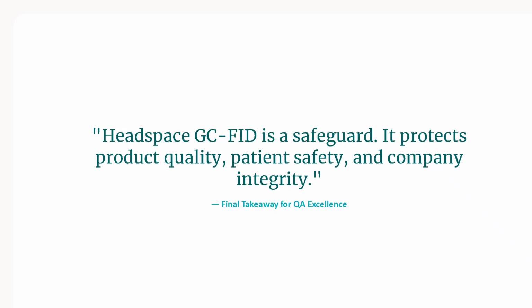Let me leave you with one thought. Headspace GC-FID is more than an analytical technique. It's a safeguard. It protects product quality. It protects patient safety. And it protects your company's integrity. Every time you run this method, you're not just measuring solvents, you're preventing problems before they ever reach the patient. And that's what true QA excellence looks like.